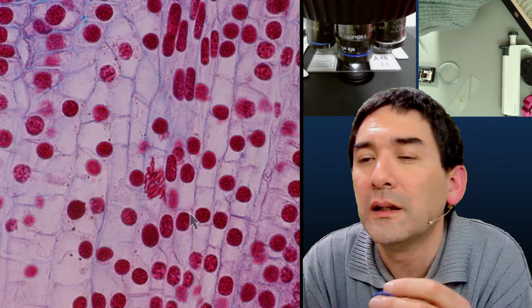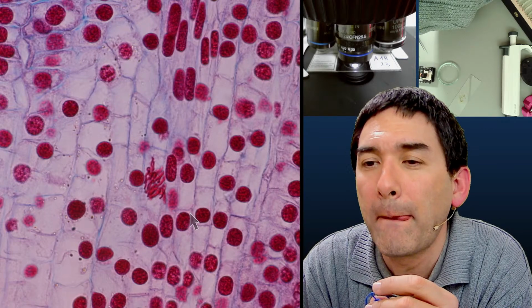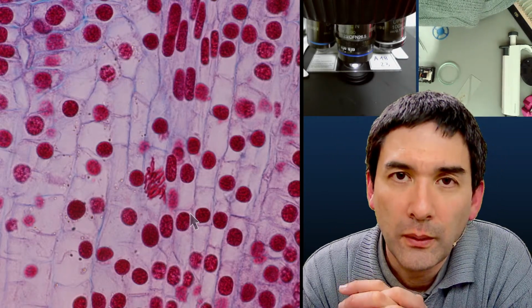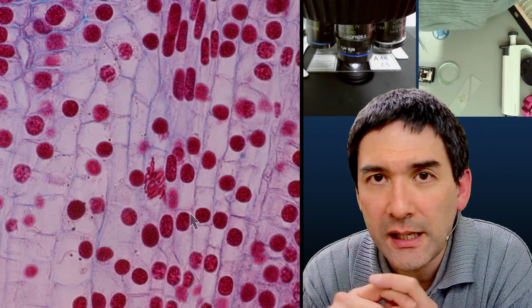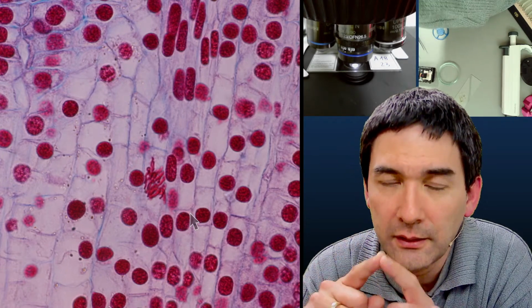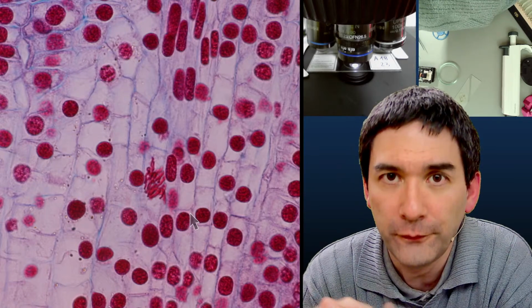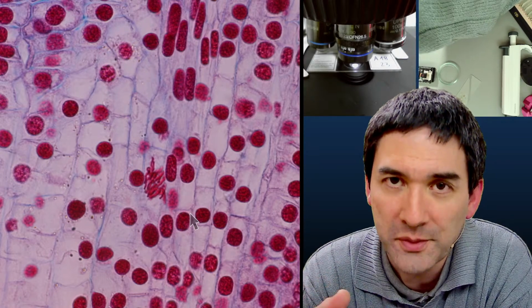What is the easiest way to connect a microscope to a monitor or computer? Depends. What you can do is the following. You can use a mobile phone. You can install software on the computer which uses your mobile phone as a webcam. So this actually works. There are a couple of programs available.